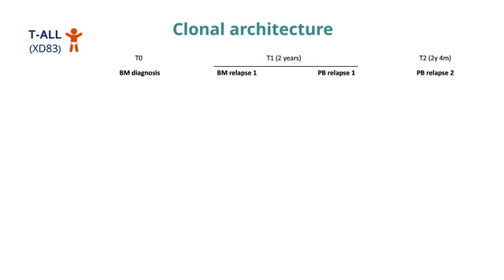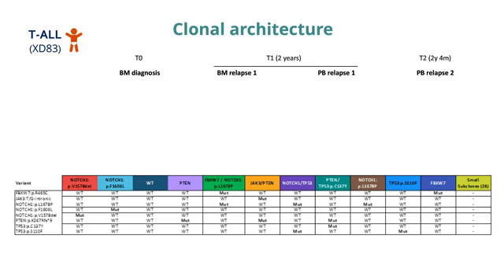If we look at the clonal composition of this patient, now you see that many more clones come into play. If you look at the mutational pattern, it seems that this clonal architecture is more dispersed, so that the clones are less related to the others. There is less overlap in the mutations, and it seems that the evolution is less stepwise compared to the other patients.